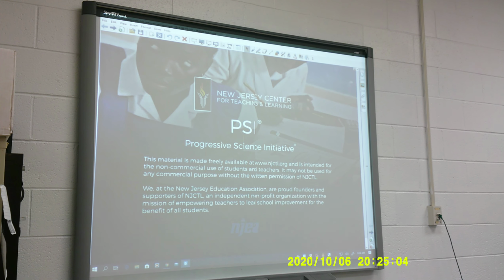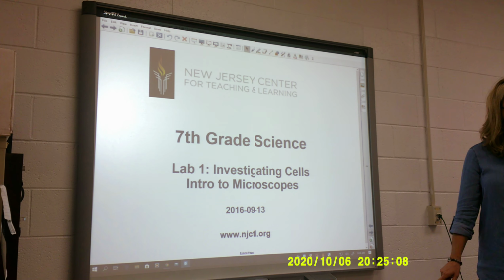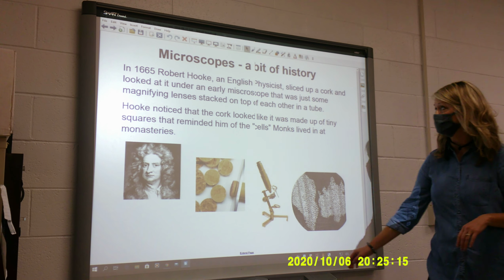All right, we're going to talk today about a little bit of background on microscopes and the different parts and pieces of the microscope. Microscopes, a bit of history.